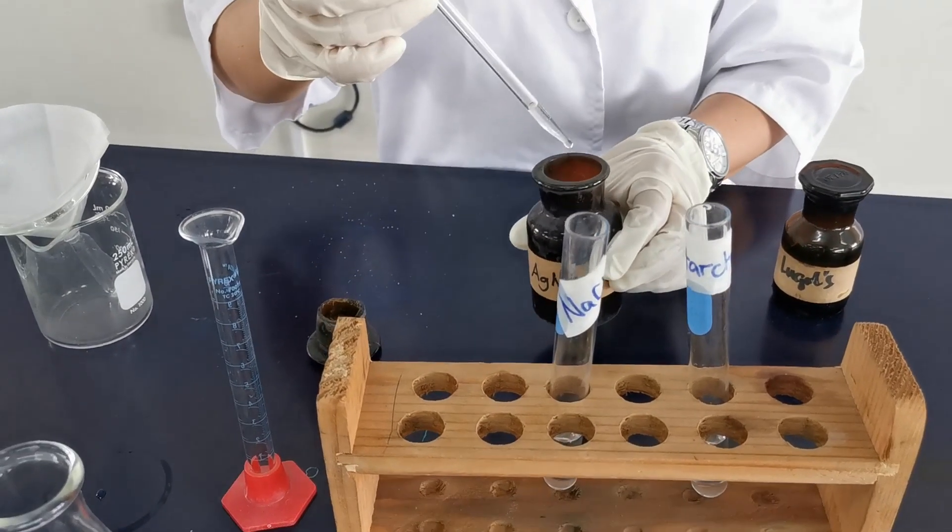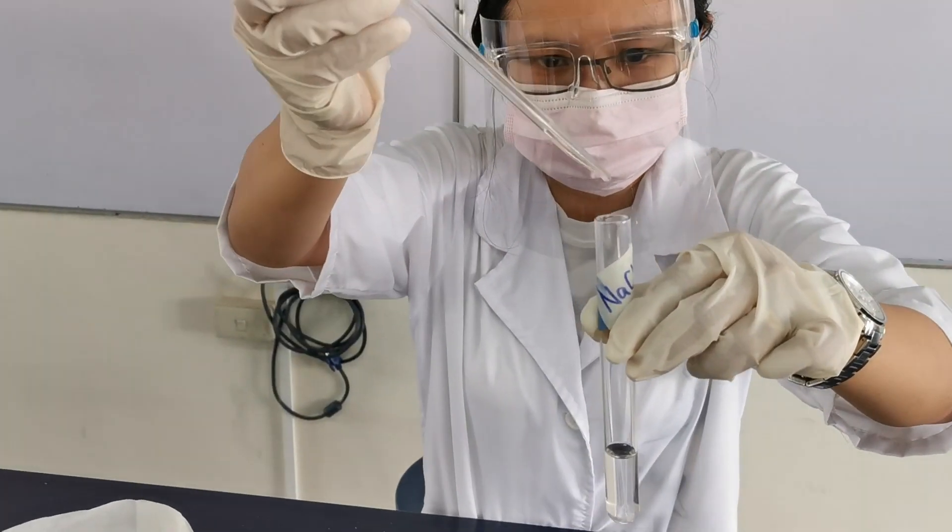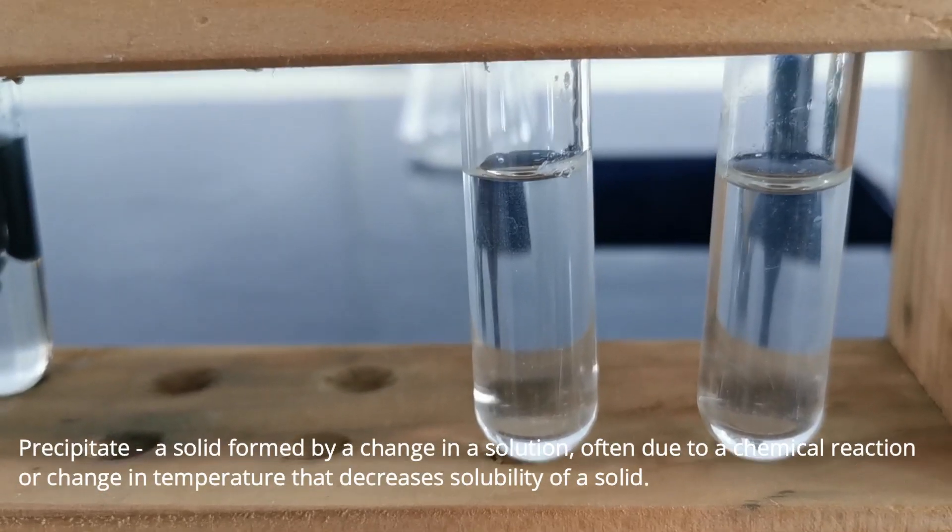Next, we add a drop of silver nitrate. The formation of a white precipitate indicates the presence of sodium chloride.